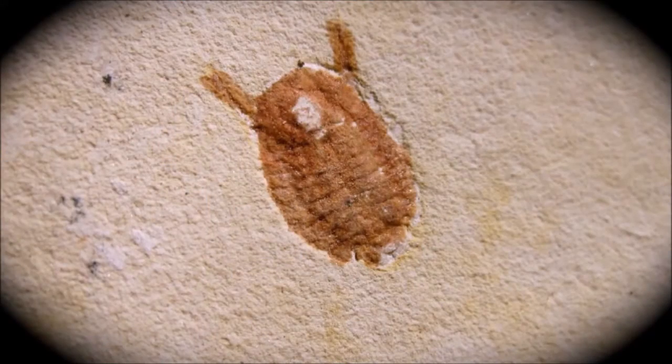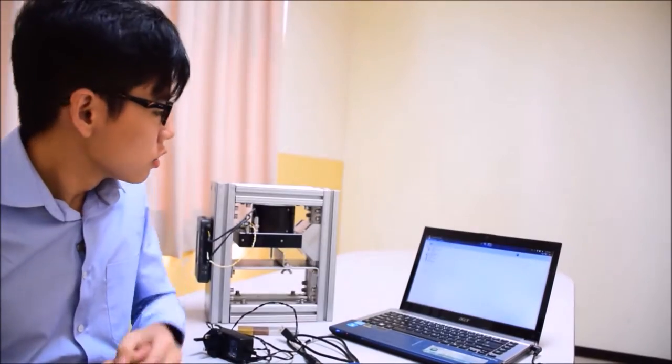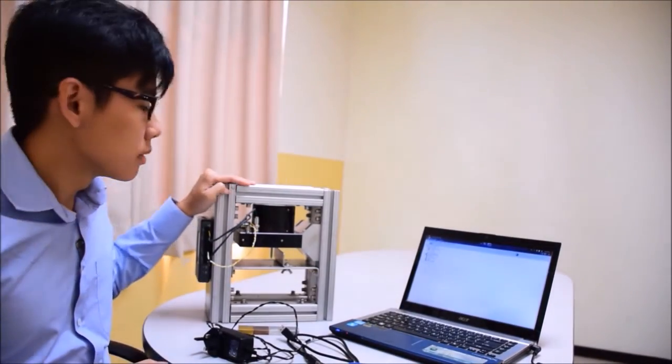These samples come in different sizes, especially in small scale size. So how are we going to make use of these samples while measuring the mechanical properties?